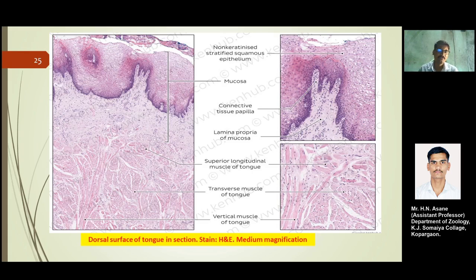You can see the mucosa layer and the connective tissue papillae projecting into the epithelial layer.